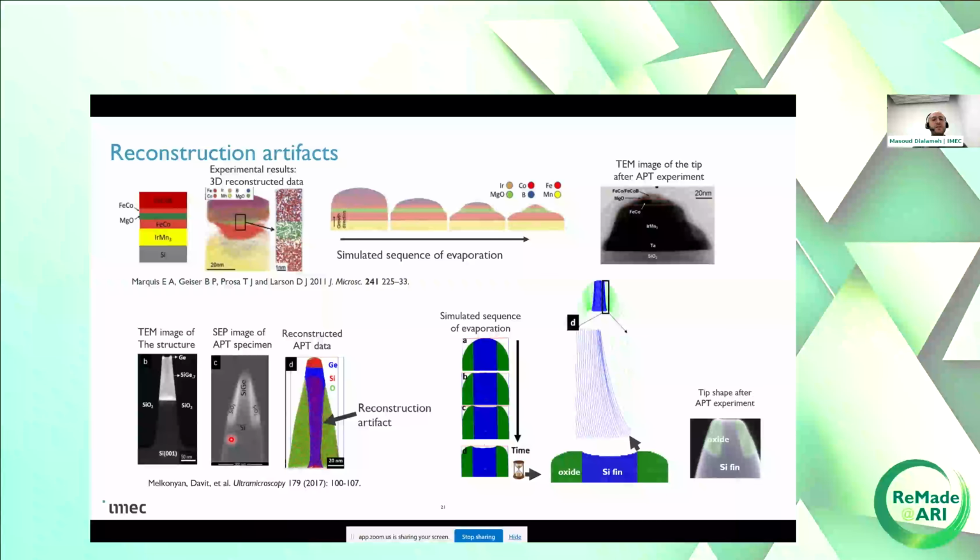So the positive taper turned to the negative taper and intermixing, so from oxygen inside the CG layer and so on. And again, the finite element analysis indicated, for the non-hemispherical apex, trajectory overlapping and trajectory crossing, and in this case, we expect to have high density zones and low density zones on the reconstructed data.